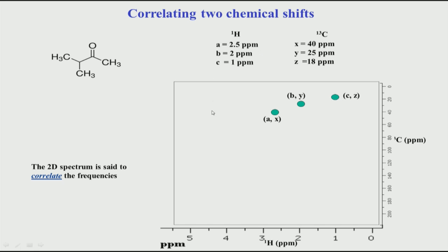Okay. So, this is an example of what is called a heteronuclear NMR experiment. Why hetero? Because we are connecting a carbon with a proton. If I have protons on both sides, y and x, we will use the word homonuclear. Homonuclear means same nucleus, same type, that is hydrogen and hydrogen. Heteronuclear means it is hydrogen and carbon. It can be carbon and carbon also. So, carbon on both axes also means homonuclear.